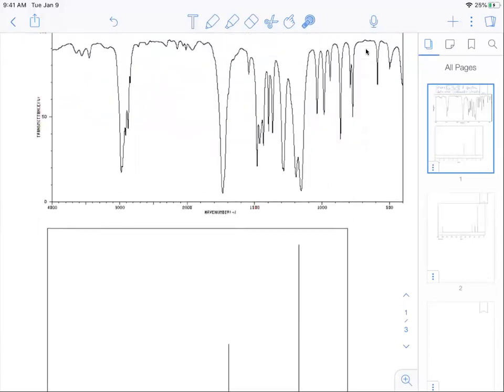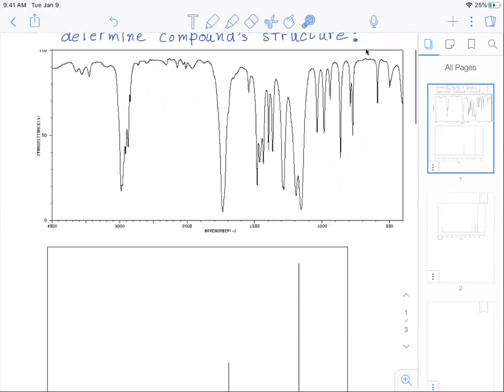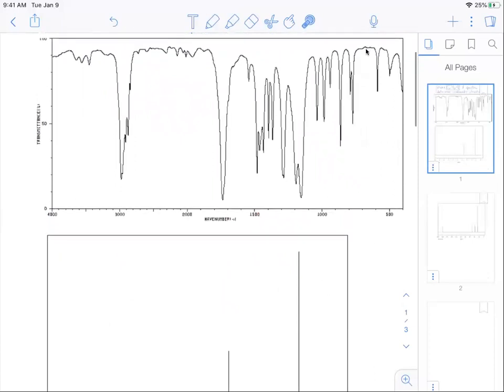Here we have an infrared graph. So usually this graph is not of high quality and you're not given this graph on any sort of digital device so most students struggle. Also the peaks are often not where you expect them to be, they don't match the literature value and this is a great example. I'll be able to show that to you and also show you how to cope with the fact that these graphs are usually really terrible.